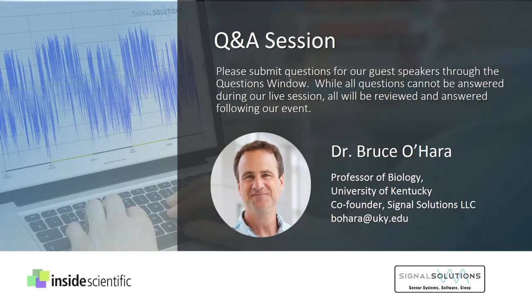Usually cages aren't vibrating all day long, right? Although we have had cases of trucks going by and things like that, and so far that has not disrupted our signal scoring. We can sometimes see that vibration at higher frequencies, but so far our sleep-wake scoring is robust enough that we can always score accurately, even with trucks driving by a facility. Excellent. Good.